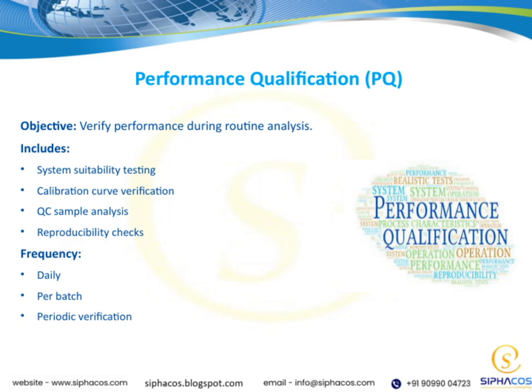Then, we have calibration curve verification to confirm that our calibration remains accurate over time. We also analyze QC samples regularly to track the consistency and accuracy of our results. Reproducibility checks are crucial too. They help us see that our results are consistent across different runs and days.